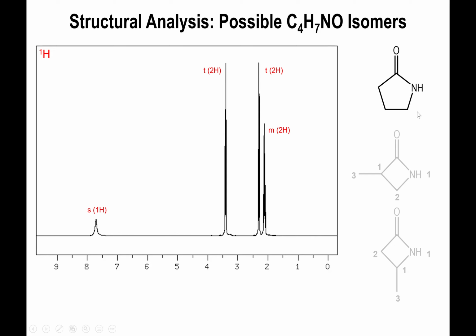However, the 5-member ring that we have here, you will notice that it contains a CH2 next to another CH2 next to another CH2. And we already said that all 3 of those carbons are inequivalent, so those hydrogens are also going to be inequivalent. And check this out. These 2 hydrogens are next to 2 hydrogens, so they're going to be split into a triplet. And what we see here is a triplet. These 2 other hydrogens are next to a carbon with 2 H's, so they're going to be split into a triplet as well. All right, that's what we see. And then these 2 hydrogens are next to a carbon with 2 H's, and then another carbon with 2 H's, and these 2 guys are not equivalent, so we end up with a multiplet.